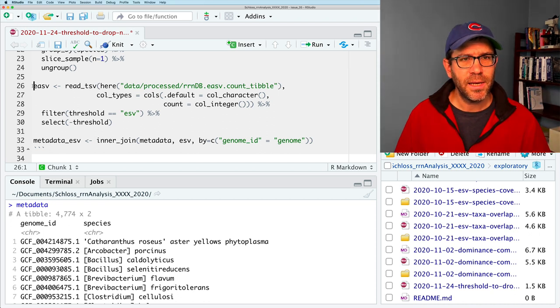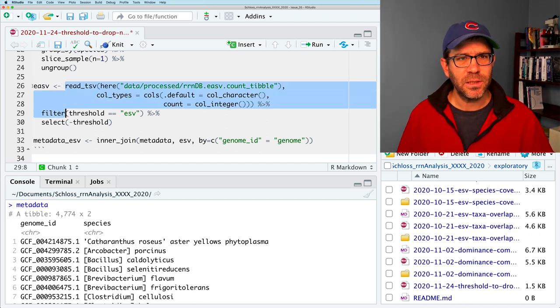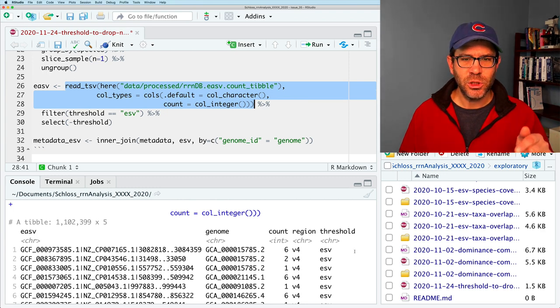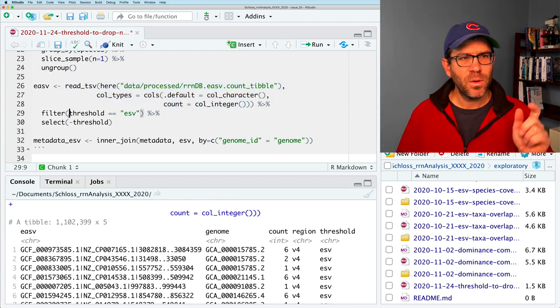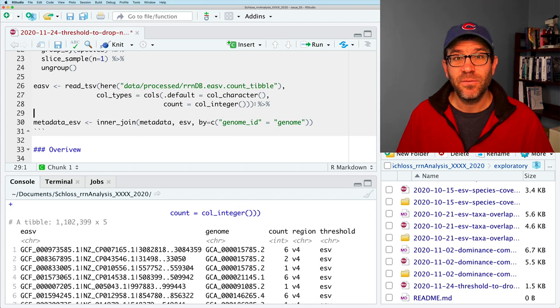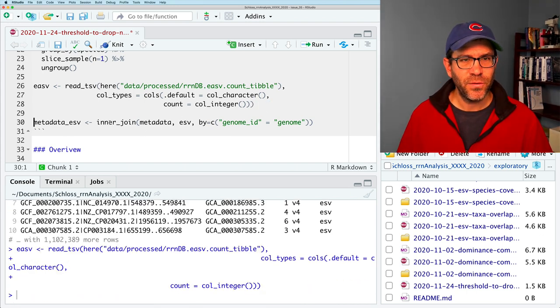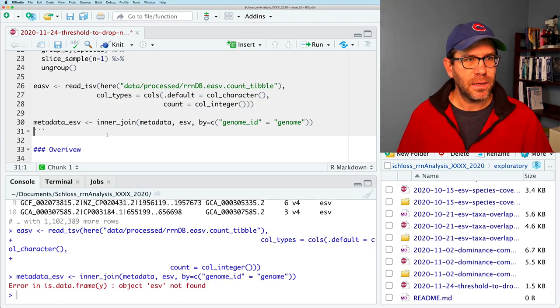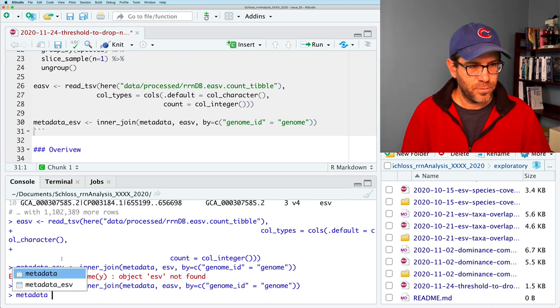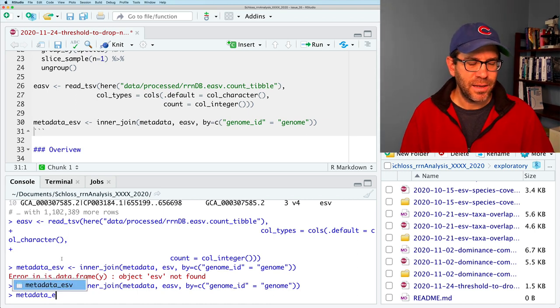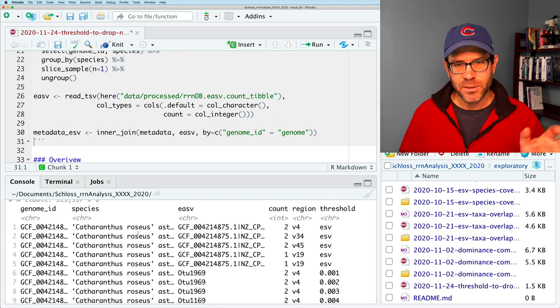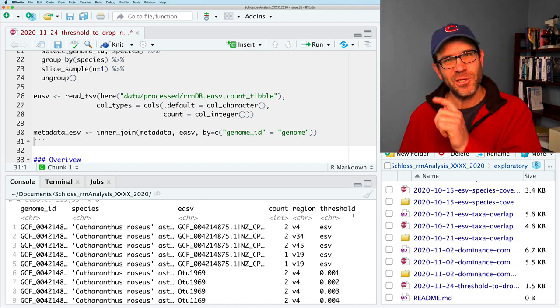Now we turn to EASV. We'll read in the EASV column, the genome, the count, the region, and the threshold — that's all good. I'm going to remove these filters and selects because I want all the data; I'm not only looking at ESVs in this episode. I'll save this to EASV, then do our inner join to join those together. We need to update the variable name — it should be EASV — and we've got genome ID, species, the EASV, the count, the region, and the threshold.